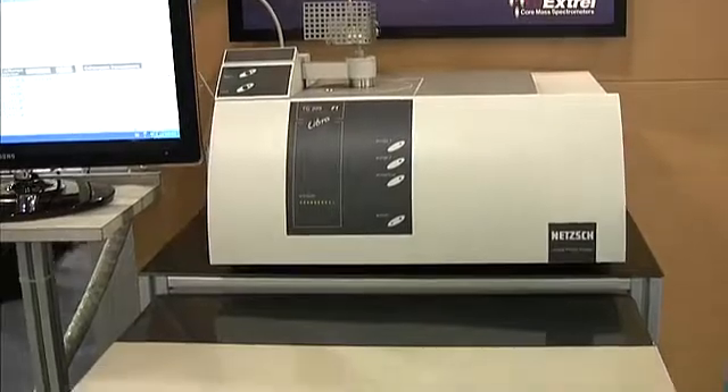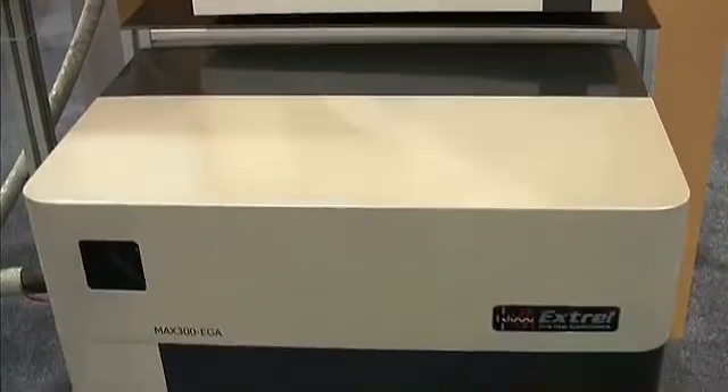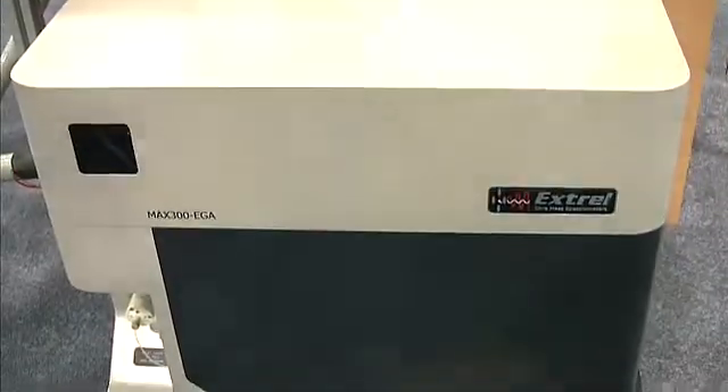Identifying the gases leaving the furnace of a thermal analyser requires special consideration. The MAX 300 EGA is a quadrupole mass spectrometer optimised for evolved gas analysis.